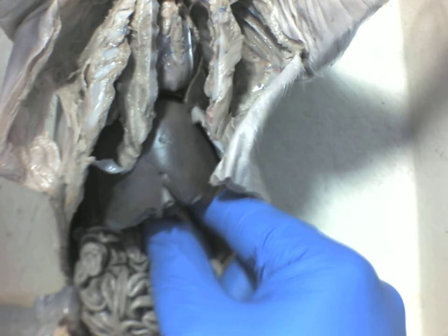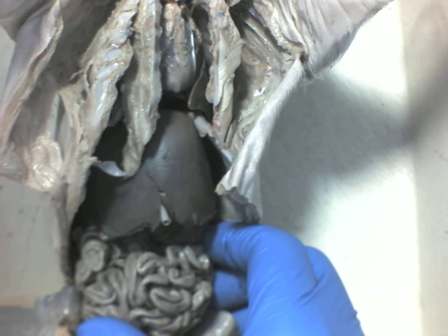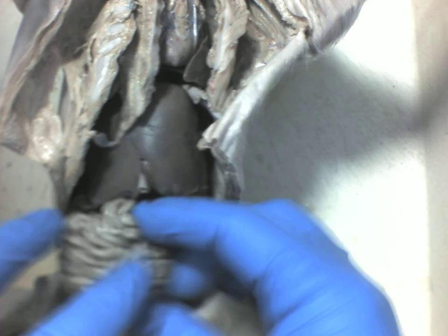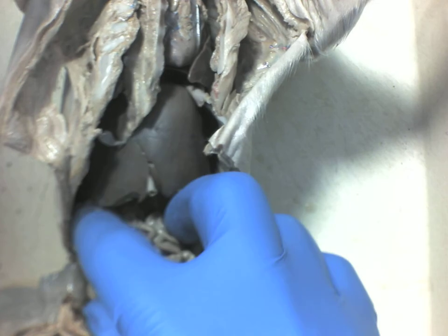After the food is broken down real good, it'll then pass from the stomach into this structure right here, which is the small intestines. Very good. And you'll notice how long they are. They literally will bend and go deep inside of here as well. That's all small intestines. They're not going to be as long in a fetal pig. When it's full grown, it'll probably be even longer than ours, especially like really large boars.